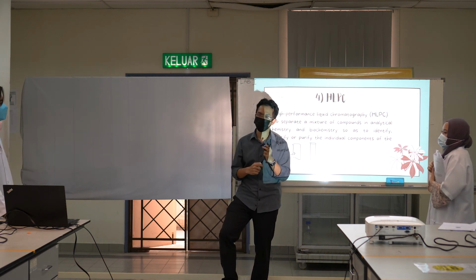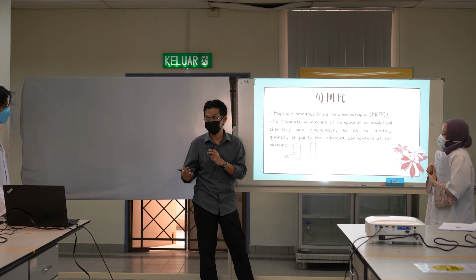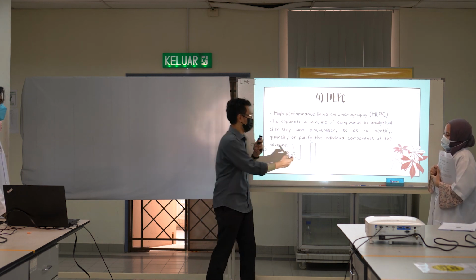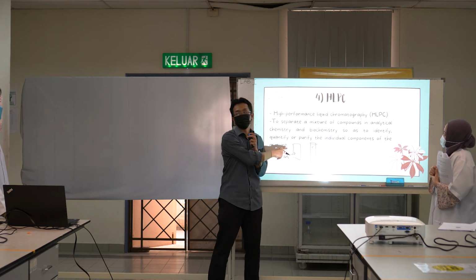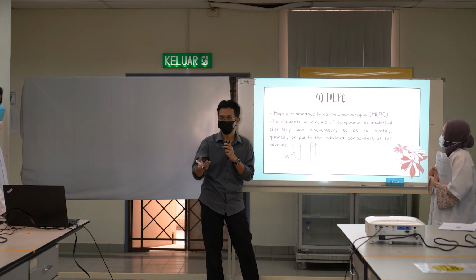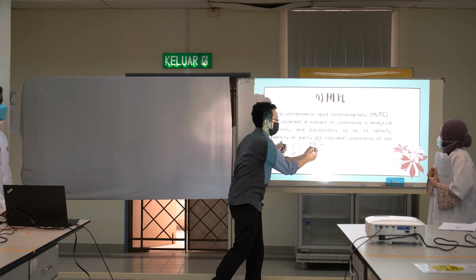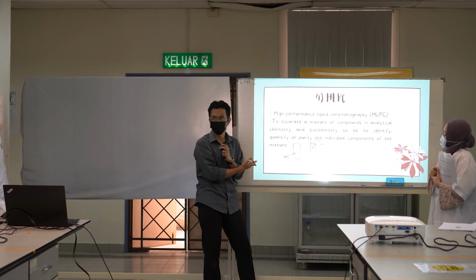Silica separates things based on polarity. Something attaches very strongly to the silica, something does not. But inside the column you can put anything, not only silica. For example, a protein that can bind very well with a certain compound X, so they put compound X inside. So it doesn't need to be silica. Silica is just an example.